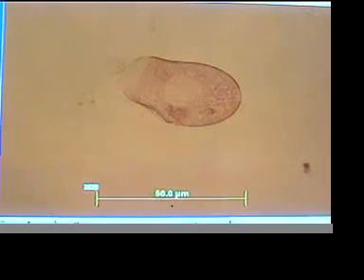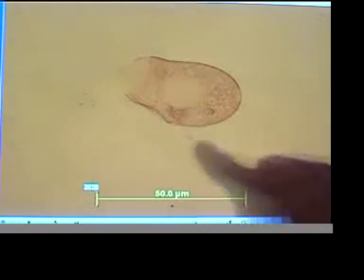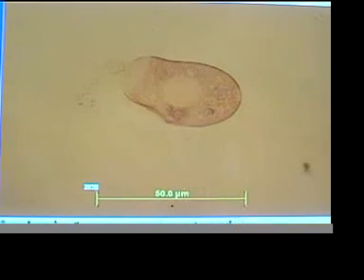Here's somebody who's already undergone a change. I don't think he's changing now. It's a small organism swimming up to him. The cilia is not moving.